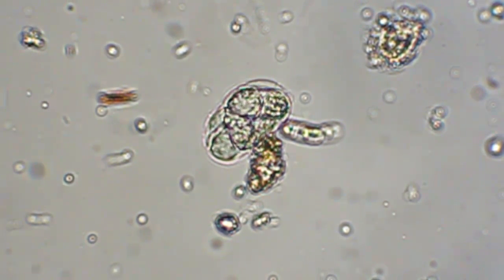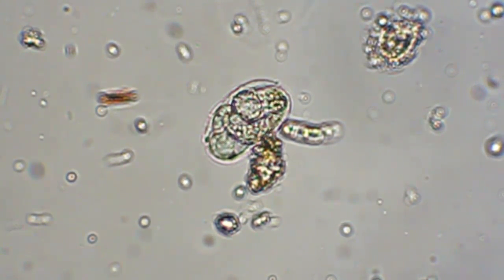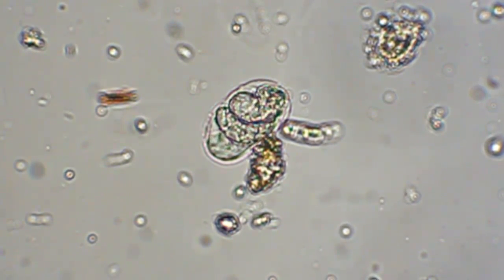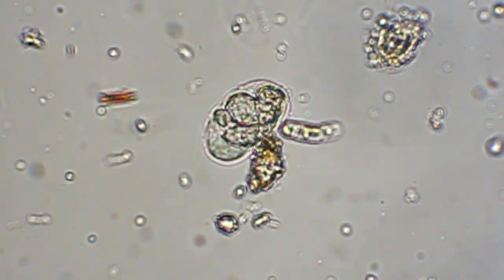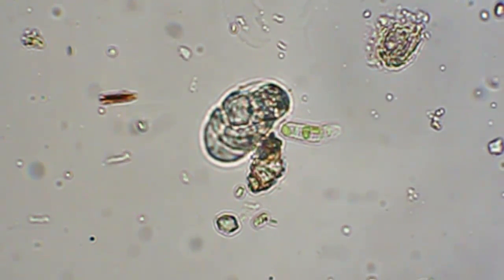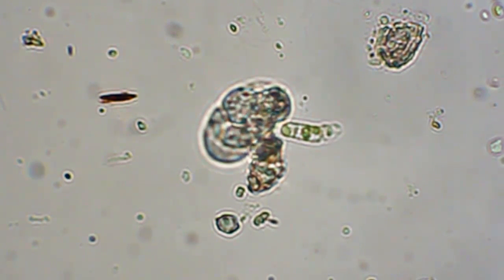I can't tell if these cells are dividing or if it's just one thing like a worm or something inside there moving around. It looks like it is changing from when I first saw it though — maybe cell division or something.